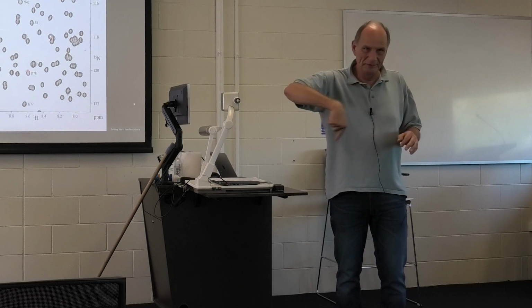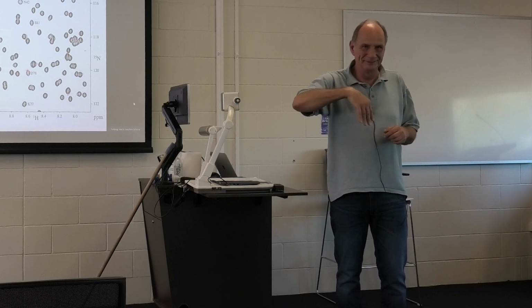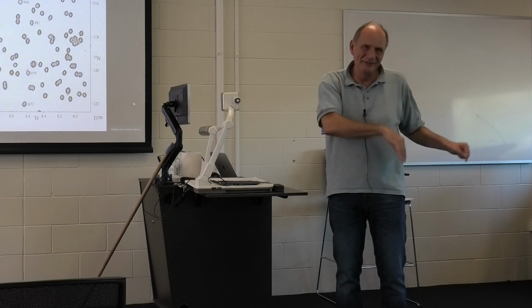So you have 110 molar of protons in water, no? And so this is a huge signal when it's in phase in one direction, and this makes a strong magnetic moment. When this rotates, it makes a strong current in the coil, and this coil makes again a magnetic field that interacts with your rotating magnetic moment.